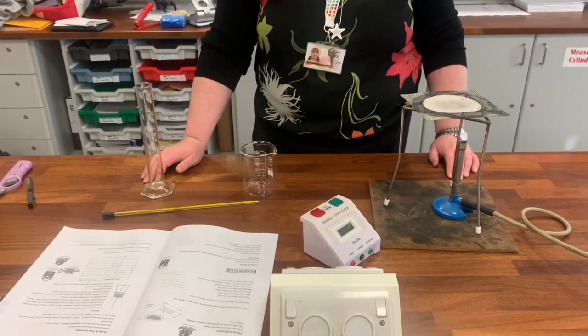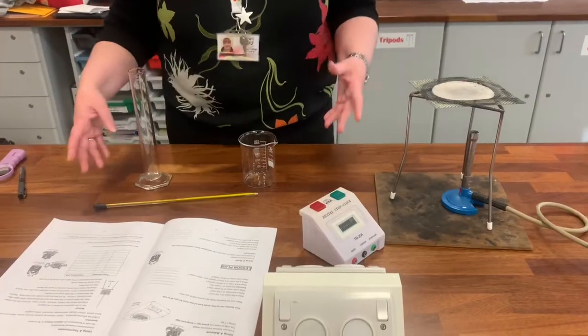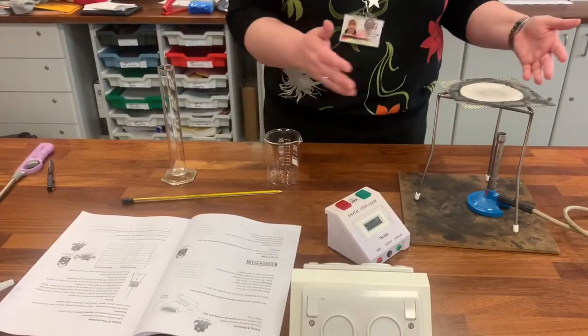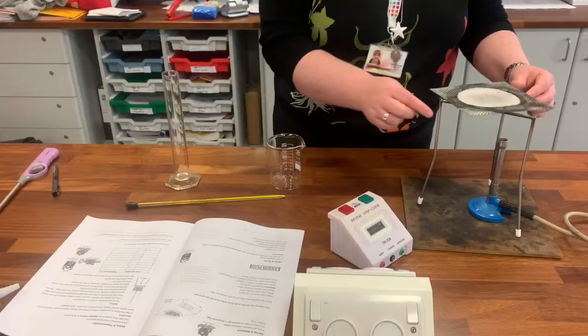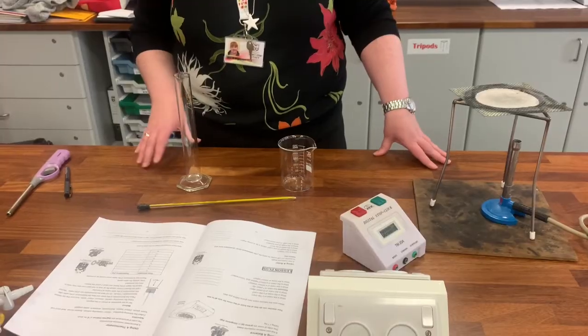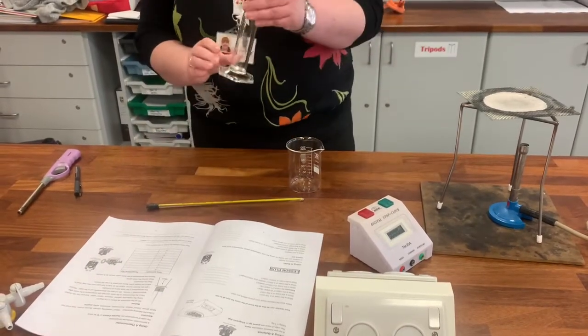In this experiment we're going to do the one in your booklet on page 15, called 'Using a Thermometer.' We're going to use the thermometer to heat water and measure the temperature as we go along. The apparatus is set up as in your booklet — you've got the safety mat, a Bunsen burner, tripod, and gauze. Your teacher will have told you what the job is of each of these things.